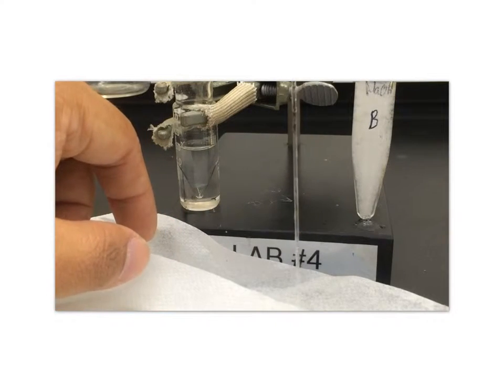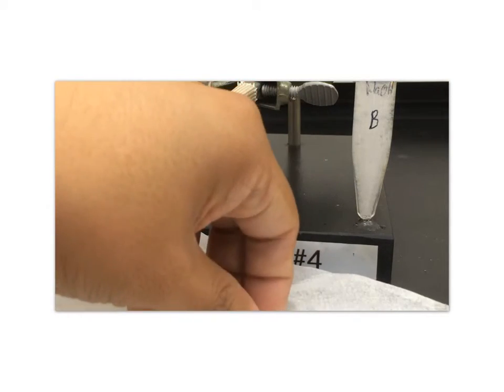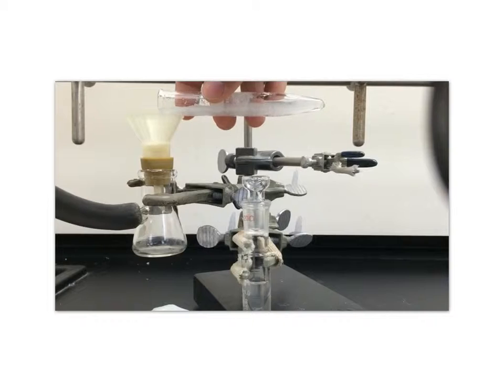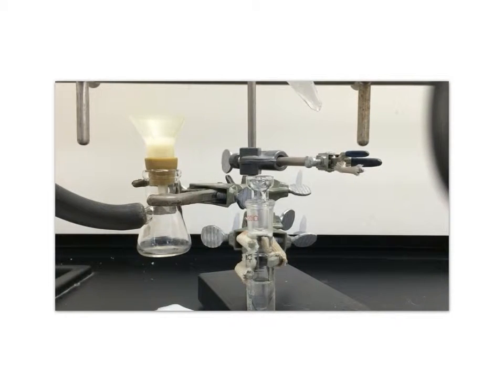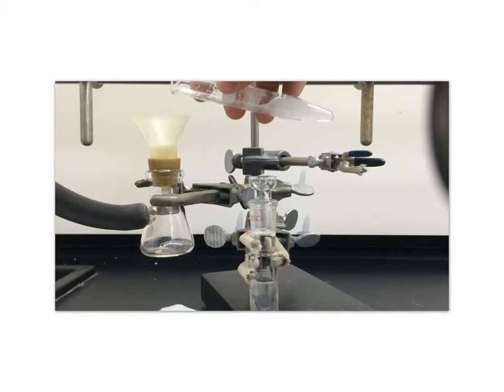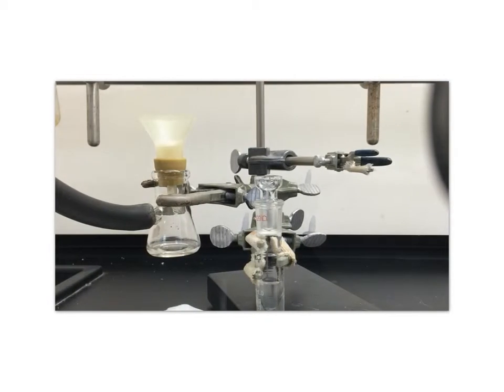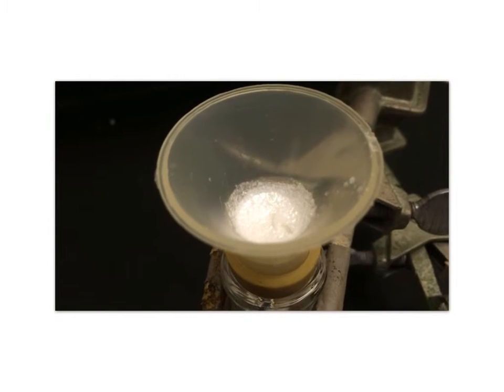For this back extraction, 10% HCl solution was used to react with the organic acid. The HCl donates the hydrogen ion to the organic acid. This would change the organic acid back to its original form, which is not soluble or less soluble in water, turning it into a solid or a precipitate, which I then filtered. This precipitate was stored and I allowed it to dry completely in order to check for its melting point later.